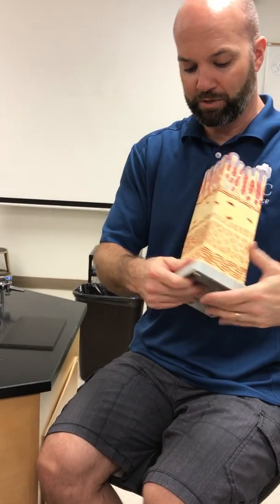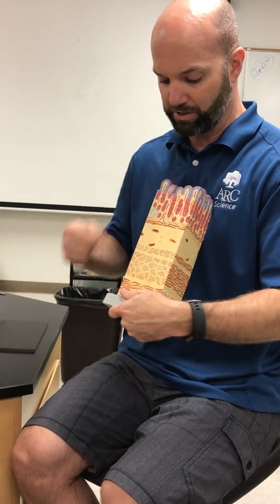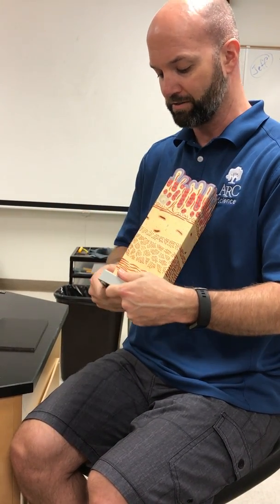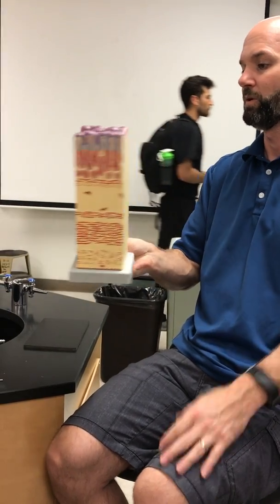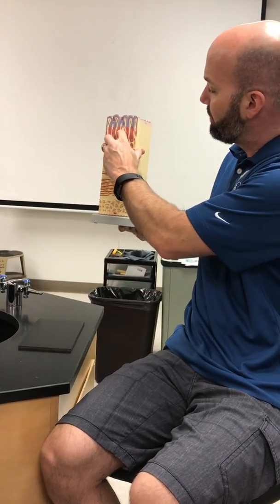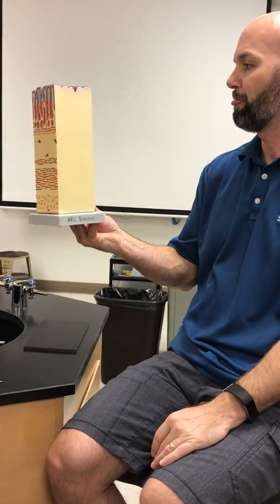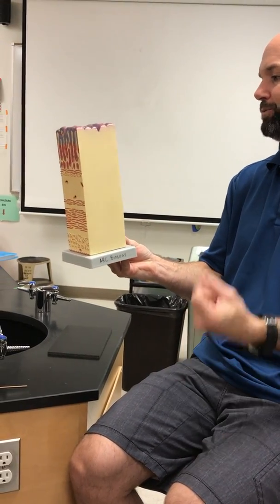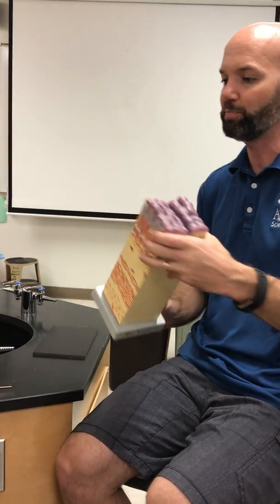And then this one's got 1, 2, 3 layers. And a serosa, and lots of mucosal glands. Little follicle, definitely stomach. And they are highlighting these red cells. They're big, those are parietal. But the other ones, we can't tell what's chief, what's G, what's mucus neck. Gotta use pictures for that.